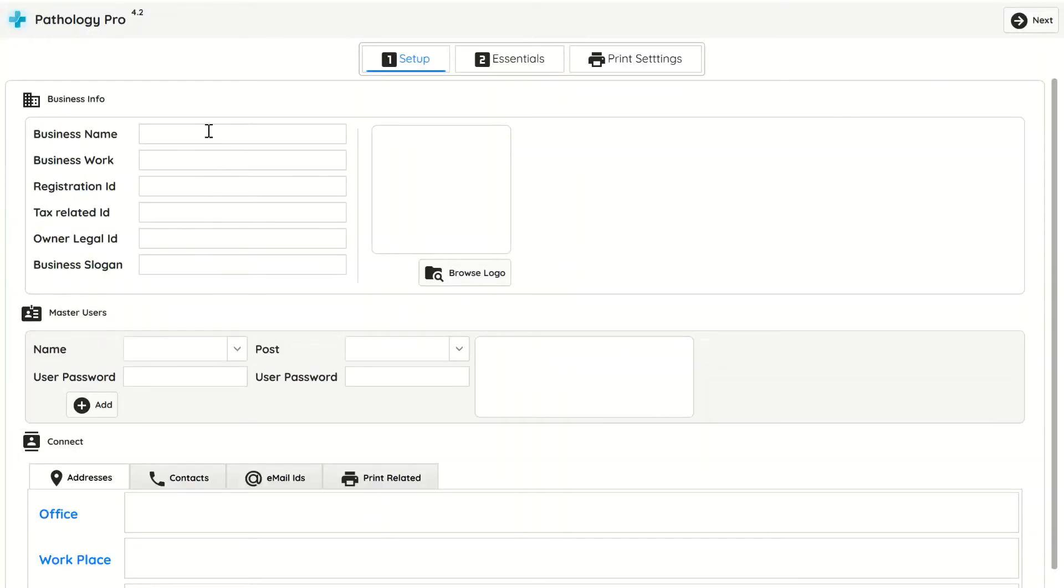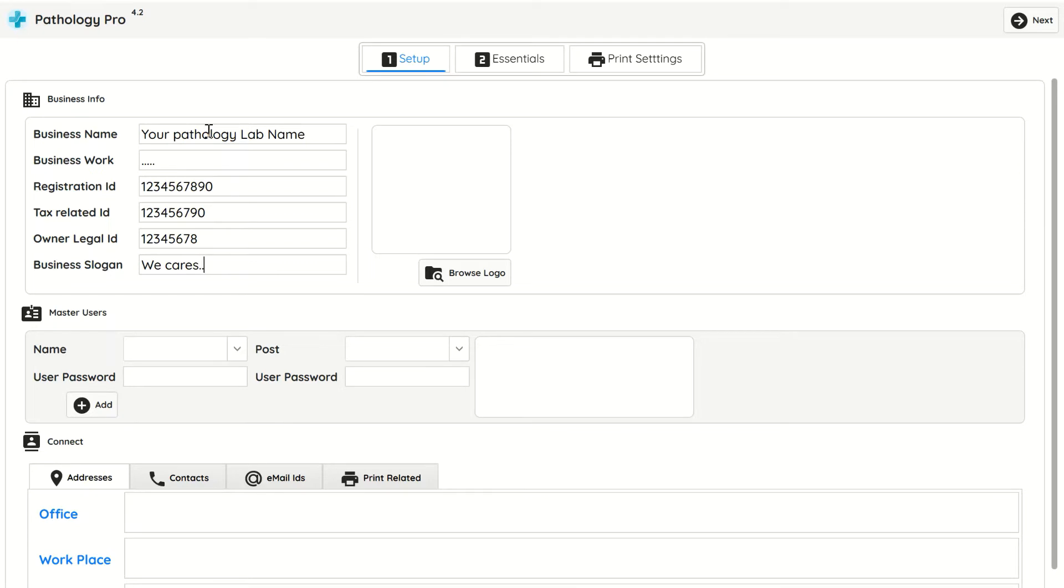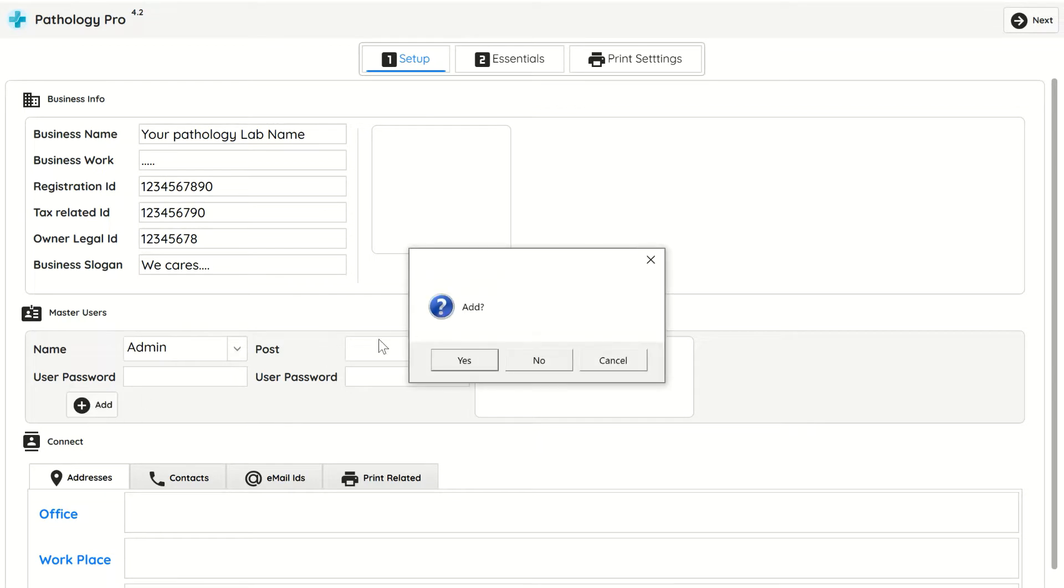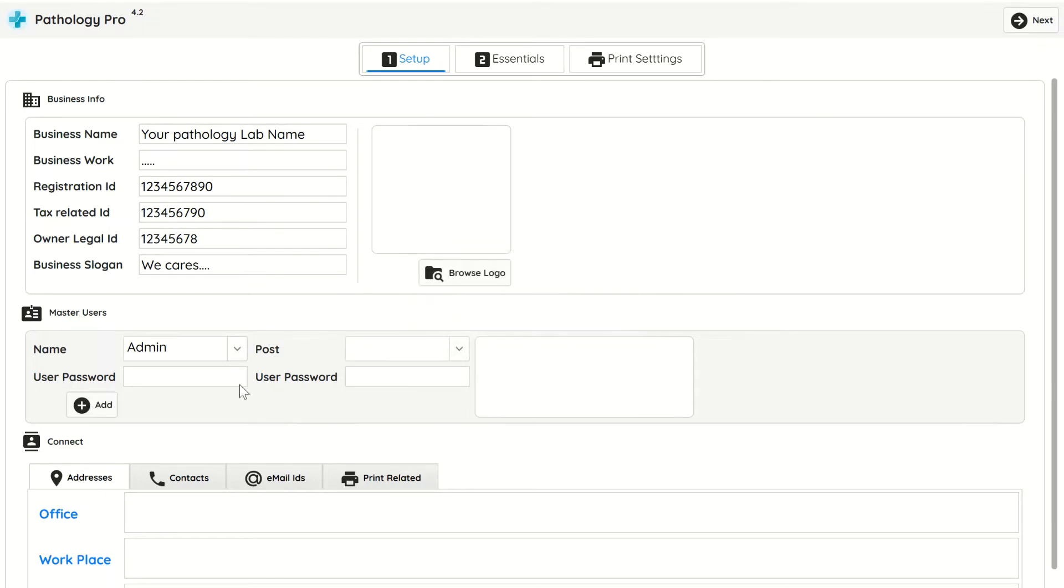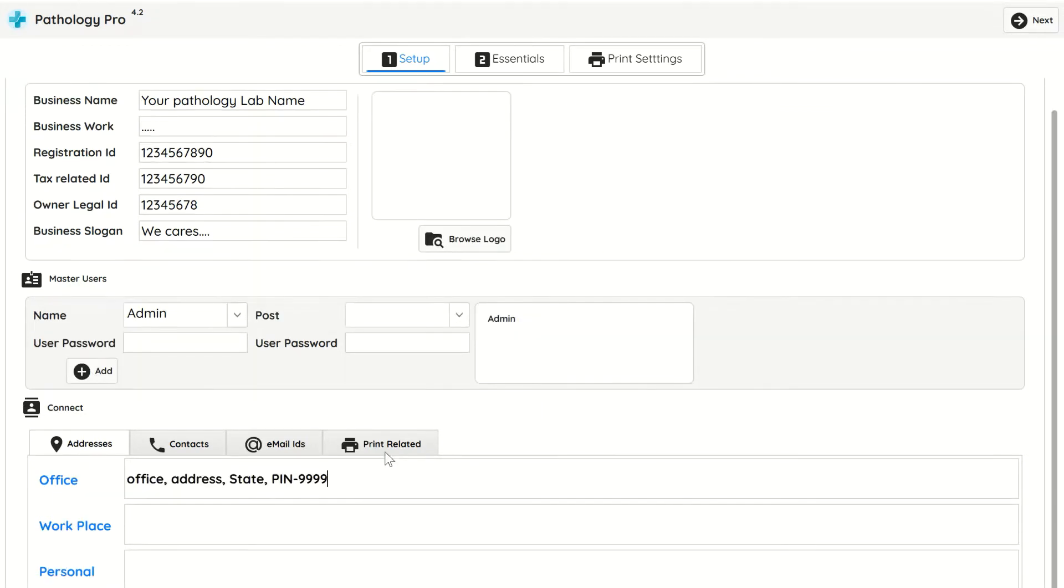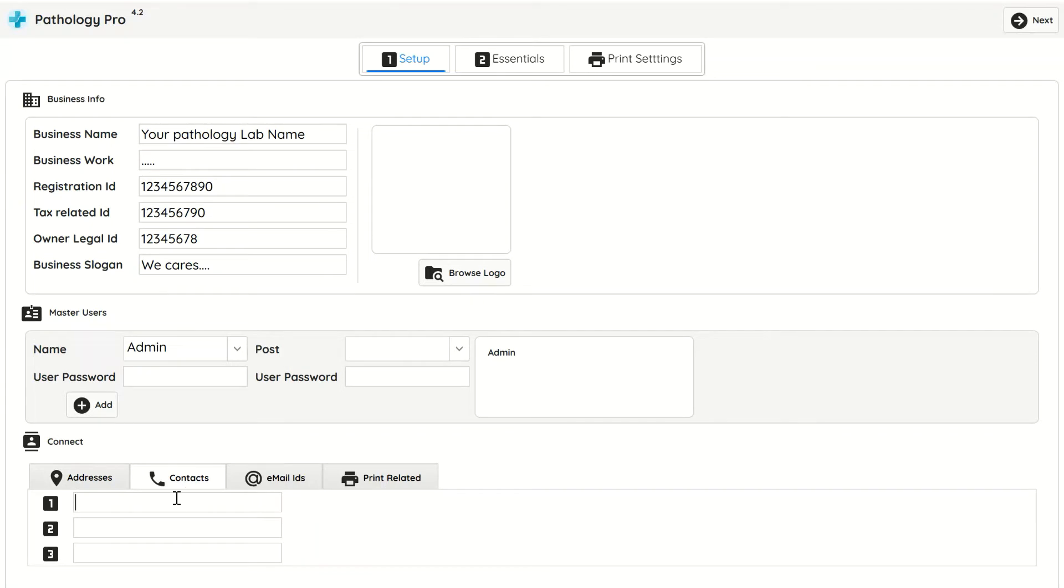Start the application. In the first setup enter all information you like to print on reports, you can edit this info later also. At least one master user should be added. You can upload your pathology lab logo also.